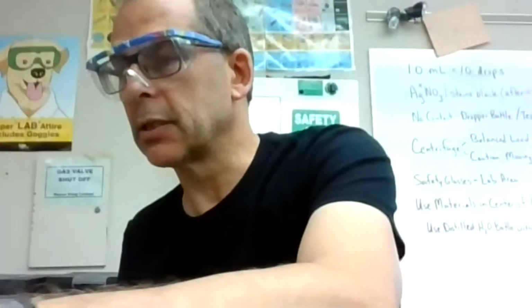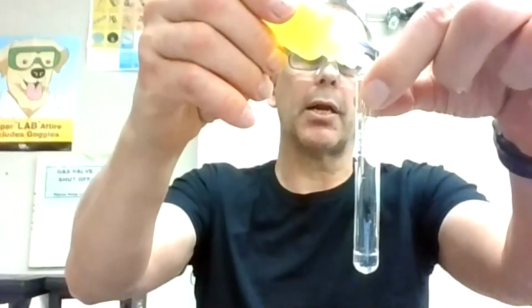So I'm going to go down the next column, and this time, again, I loaded up my magnesium, calcium, strontium, barium, and this time I'm going to add CrO4. All right, so I'm going to look at this. 1, 2, 3, 4, 5, 6, 7, 8, 9, 10. Okay, it's yellow, but it's the yellow solution I'm adding. It's still transparent. So we're going to say that that is no precipitate right here.